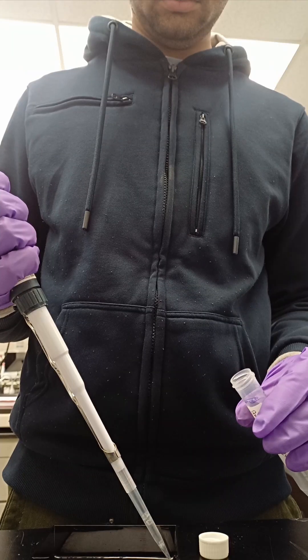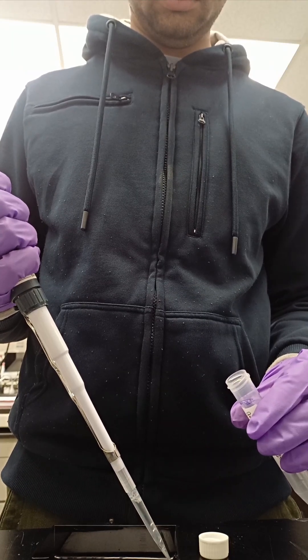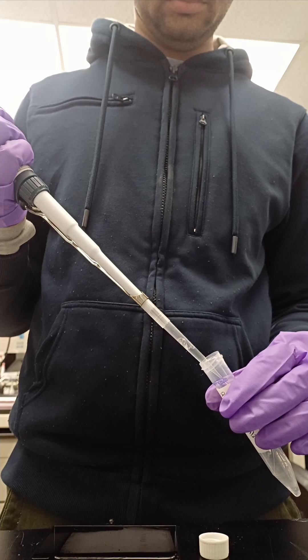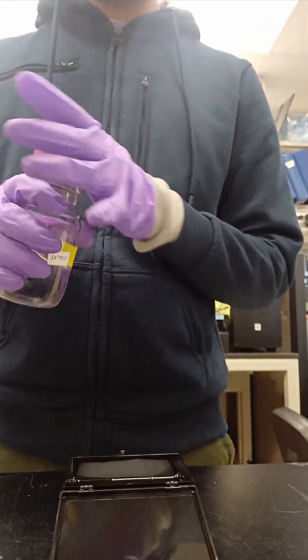Then wash with TBST and incubate with secondary antibody. It should be specific to the host of your primary. In my case, it's an anti-mouse secondary antibody. Repeat the washing step.